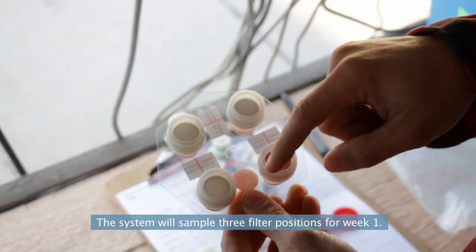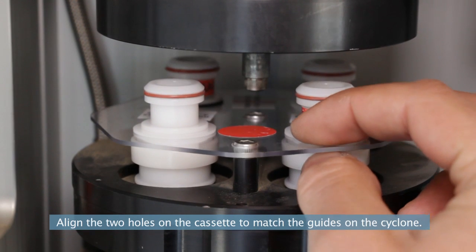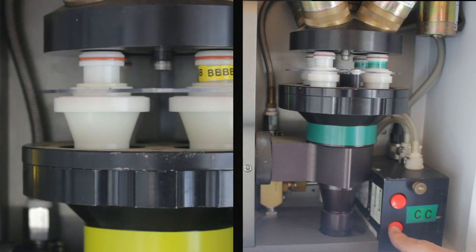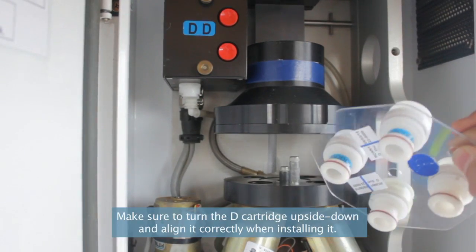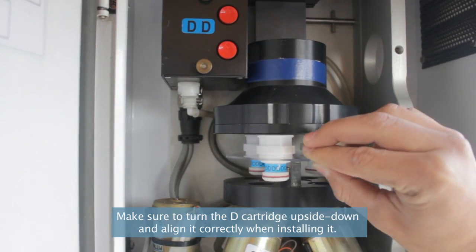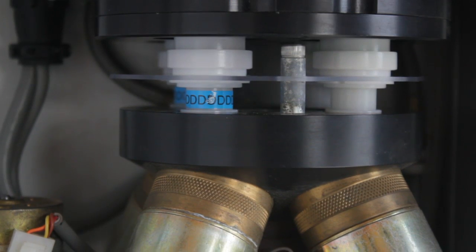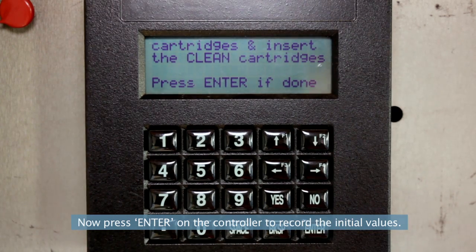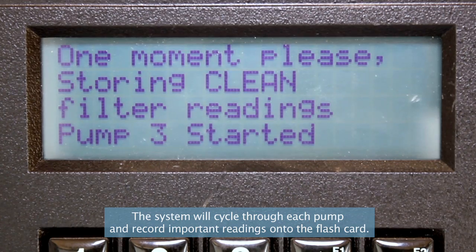The system will sample 3 filter positions for week 1. Align the 2 holes on the cassette to match the guides on the cyclone. Make sure to turn the D cartridge upside down and align it correctly when installing it. Now press enter on the controller to record the initial values. The system will cycle through each pump and record important readings onto the flash card.